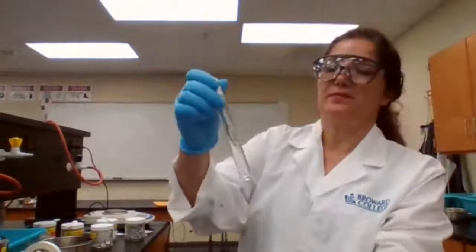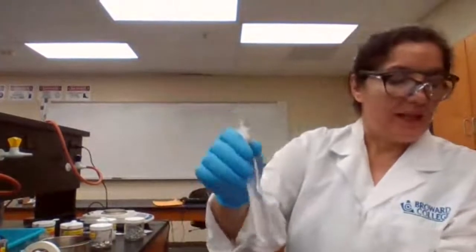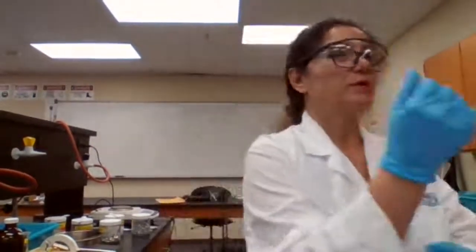At least we have something to work with, right? Our 0.2 is still reacting. And part 4 of the experiment says just use those samples from part D of the experiment. No need to repeat this here. Just record the temperature and time from part D. So we only have one part left. So it's the part D that we have to work with.